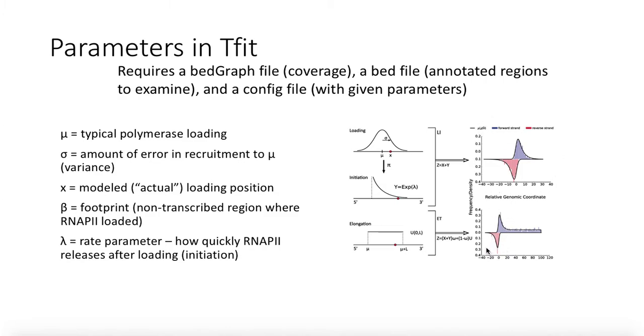But in regions that are lowly transcribed, we may not be able to pick up this middle region quite so well. Okay, so we can incorporate a footprint, especially over things like eRNAs, which are sometimes lowly transcribed, especially not under any sort of treatment. So we can plug this in and say there might be a gap between the positive and negative reads, so let's go ahead and include that anyway as a potential call. So it could be very important, could be irrelevant, depending on how good your depth, coverage, complexity, etc.